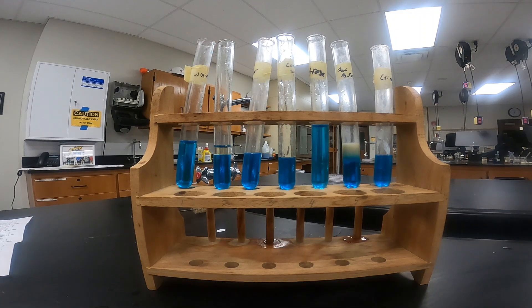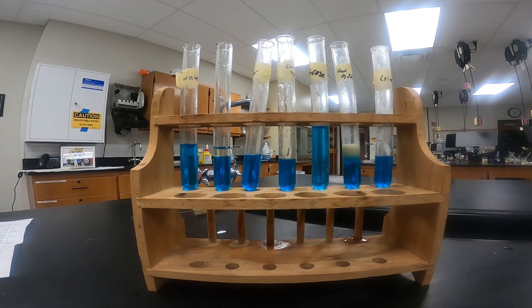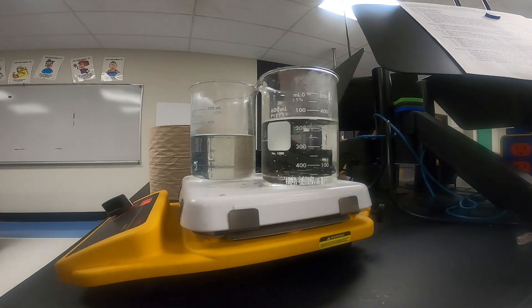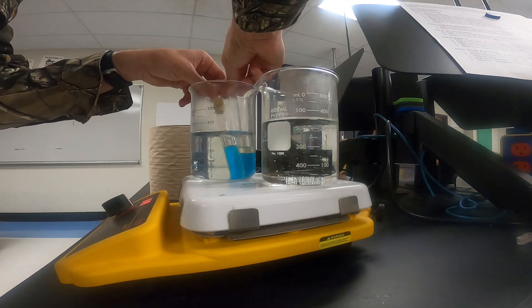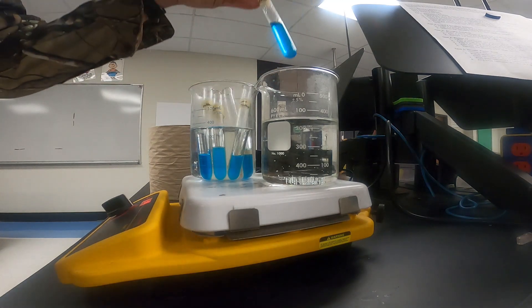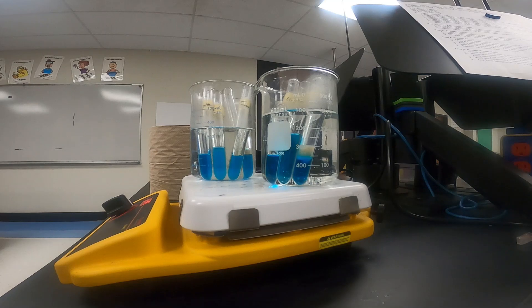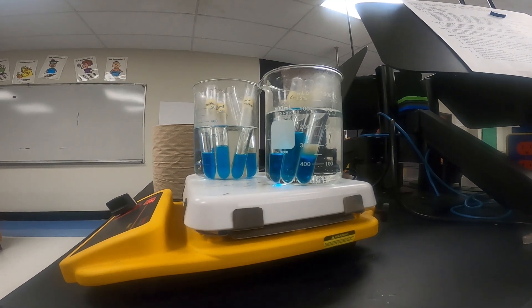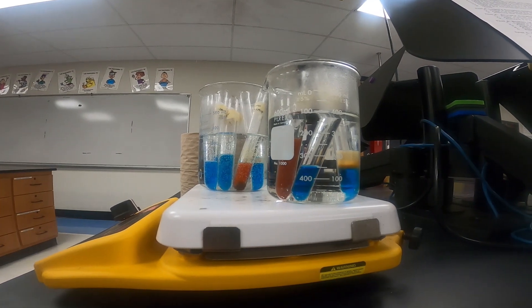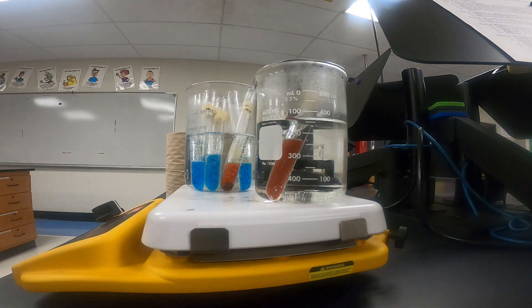Now we have each one of our samples in our test tube with the Benedict's solution. We'll take them over to the hot plate and heat up these test tubes for about three to five minutes. We have each one labeled so we know which one's which once we're finished in the hot water bath. We'll just gently place each one in our hot water bath and let them sit for about five minutes. Right now they're all blue.